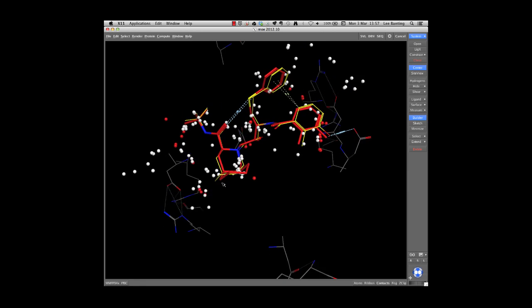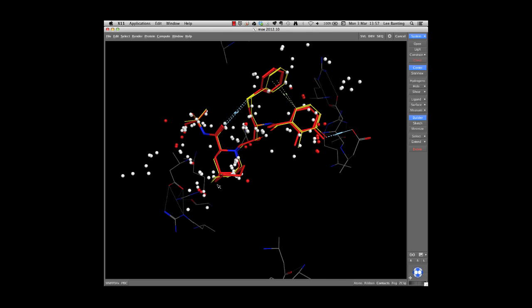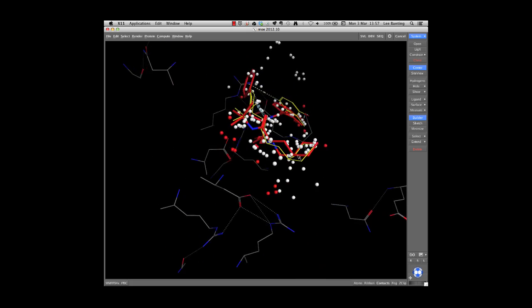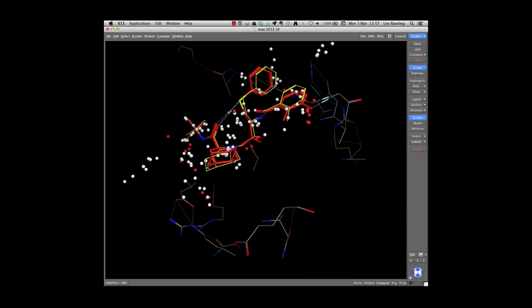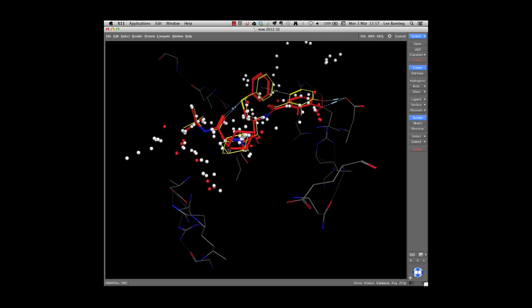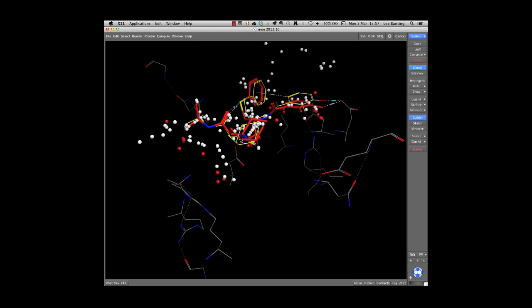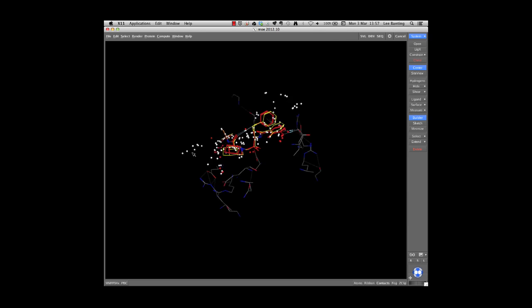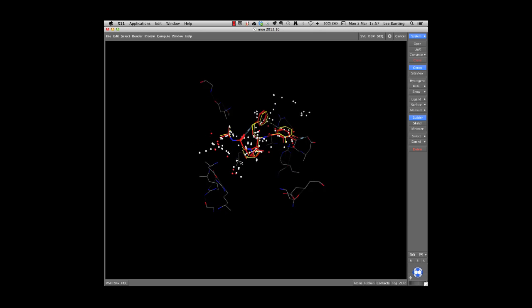When I read the molecular file in for the inhibitor, it was actually a molecule of Viricept, and what it shows you is that it finds faithfully the docking position of Viricept within the HIV protease. Now hopefully that has shown you how docking can work for us.